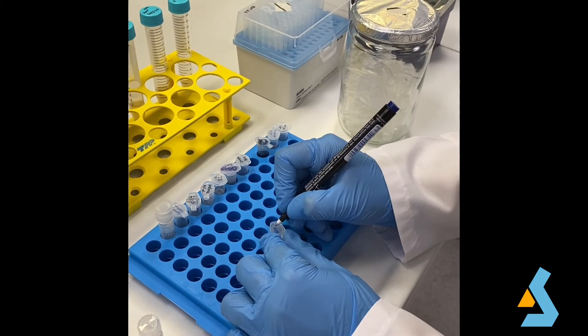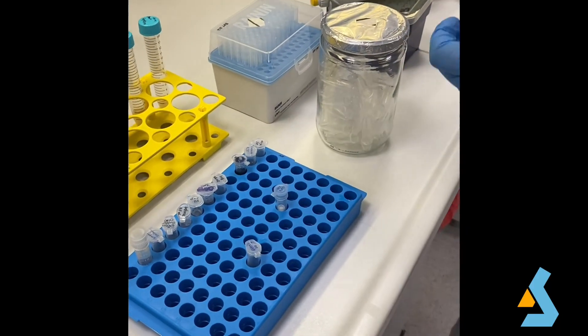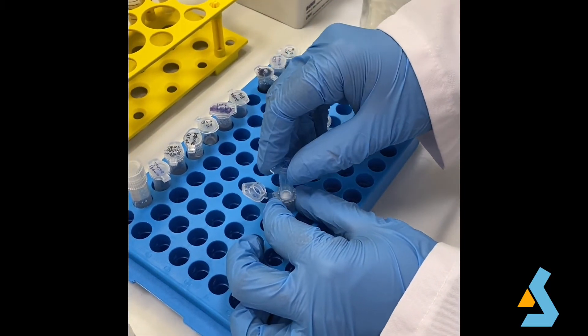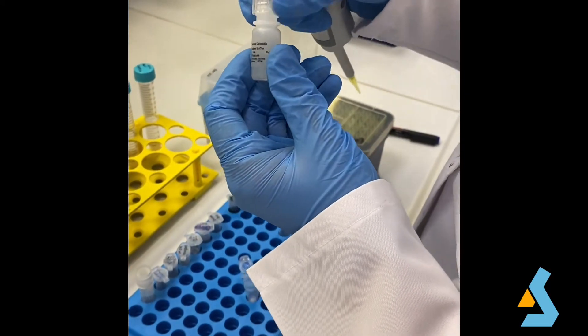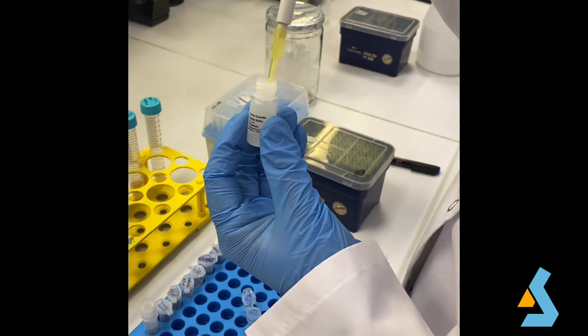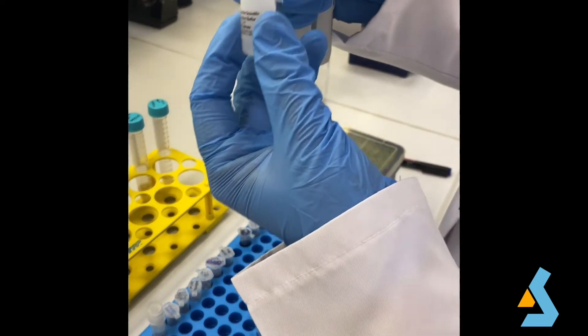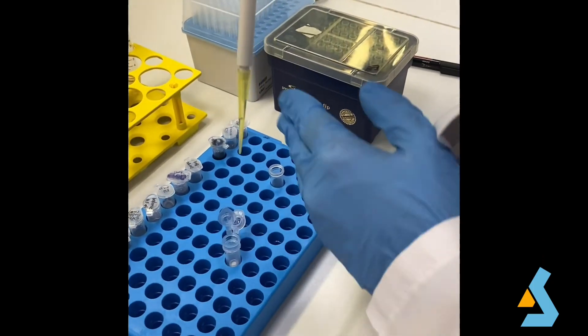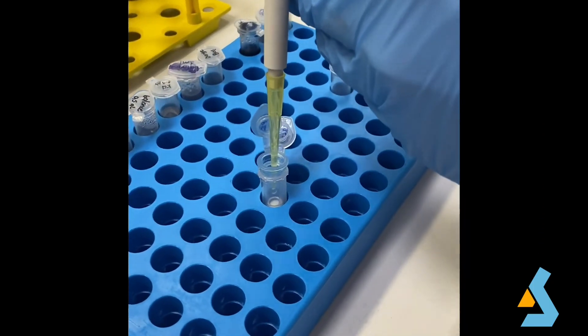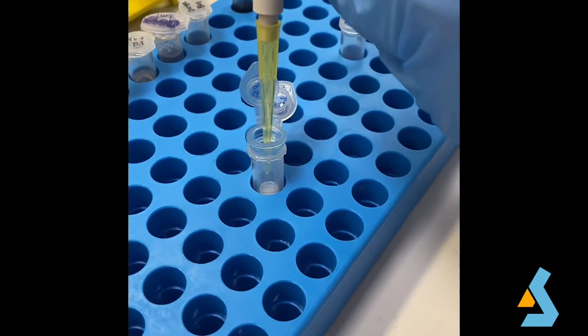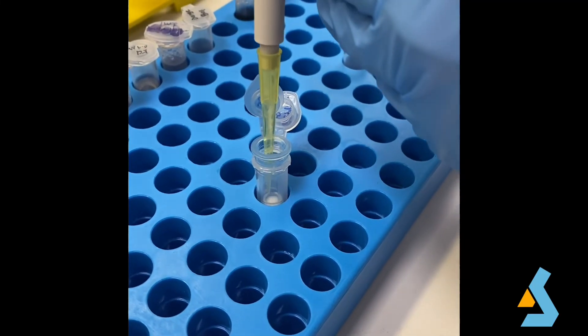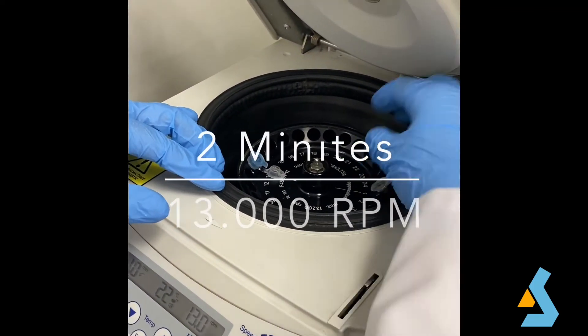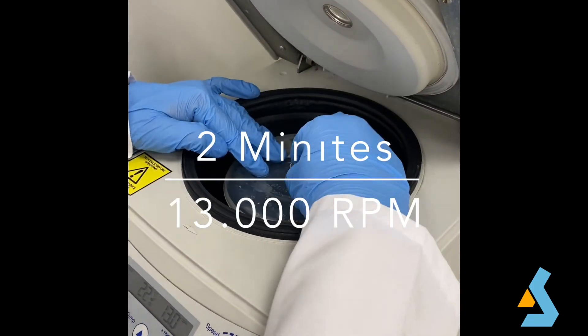Finally, we should label a fresh microcentrifuge tube and transfer the spin column into this new tube. Coming to an end, we need to add 50 microliters of the elution buffer to the center of the spin column in order to elute the plasmid DNA. While adding elution buffer, we should be careful not to touch the membrane with the pipette tip. The tube is then centrifuged for two minutes at 13,000 RPM.